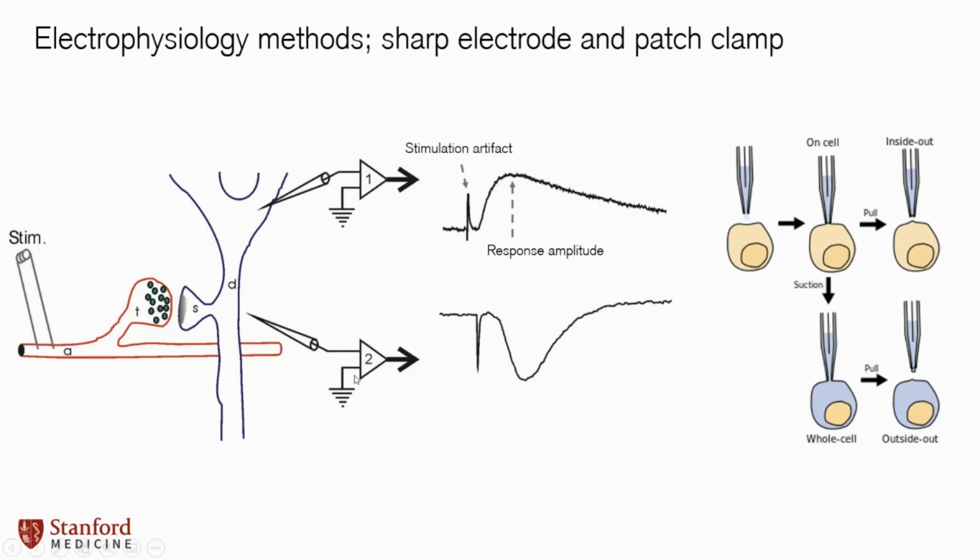And most people, when they hear electrophysiology, might be thinking sharp electrode physiology. That's where you take this little sharp glass electrode and you poke it inside the cell. And then you have another reference electrode that you're putting in the bath solution outside of this cell. And you're basically measuring what this individual cell is doing. And here you can see they'll actually inject a current into the cell. You'll get this stimulation artifact. And you can measure the amplitude of that cell that you're poking there.